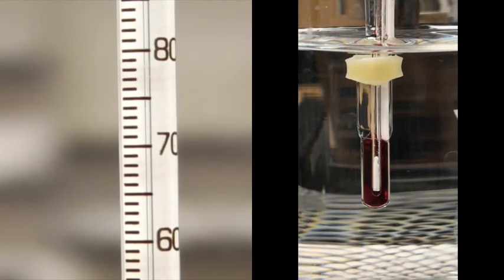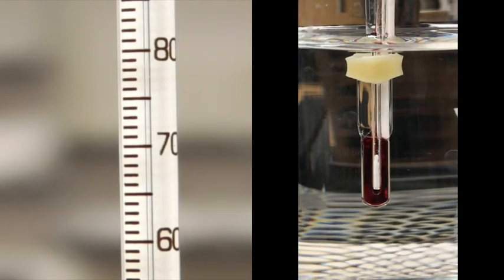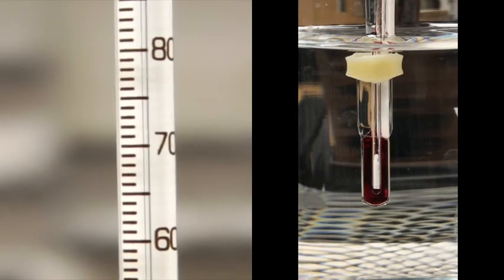Alright, so we're just starting to heat the water. Right now it's reading about 26 or 27 degrees. And we know the melting point's at about 70, so we've got a little bit to go.